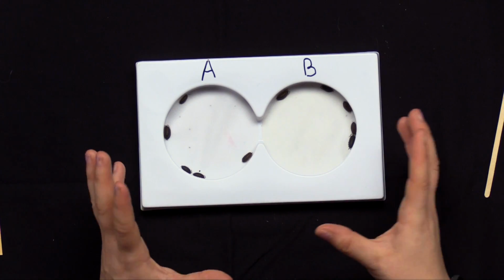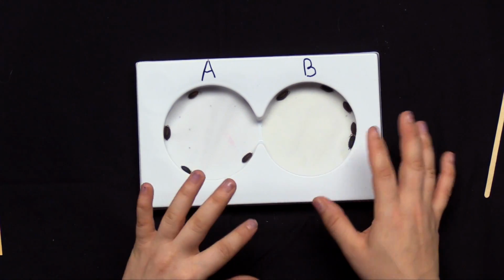One way that we could confirm our data if we wanted to is to repeat the experiment. That would probably involve taking this out, washing it, putting the pill bugs in anew, and going through the whole thing again. We're not going to sit here for hours and hours and watch pill bugs, but if we had different groups doing this, we could confirm the different settings and take different group data and see if there was a commonality among the data.